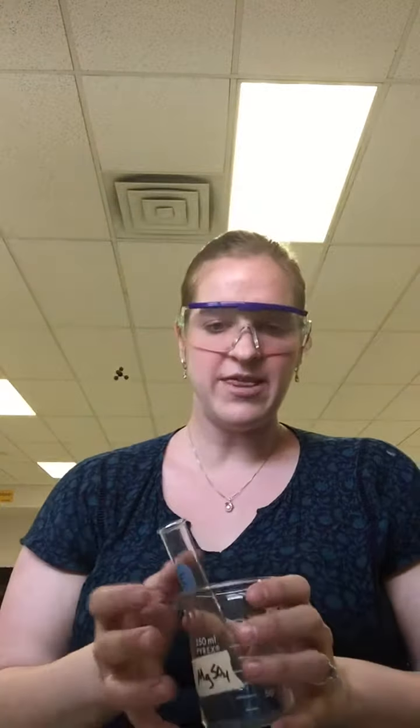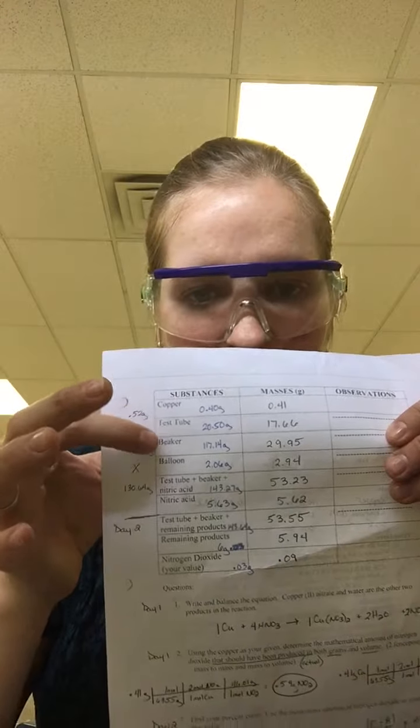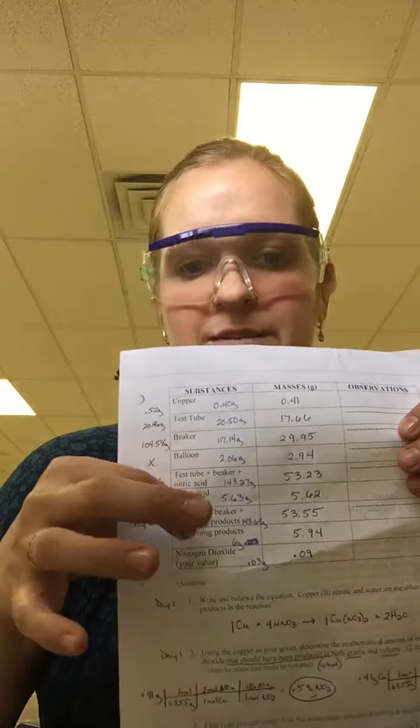Once you get the balloon taken off, you're going to put this on the scale and get the mass of your test tube, your beaker, and your remaining products. So how do you get your remaining products? Get rid of the test tube and the beaker. Not literally, but you already have the test tube and beaker masses. Take those away from the mass that you just got, and that should give you your remaining products.